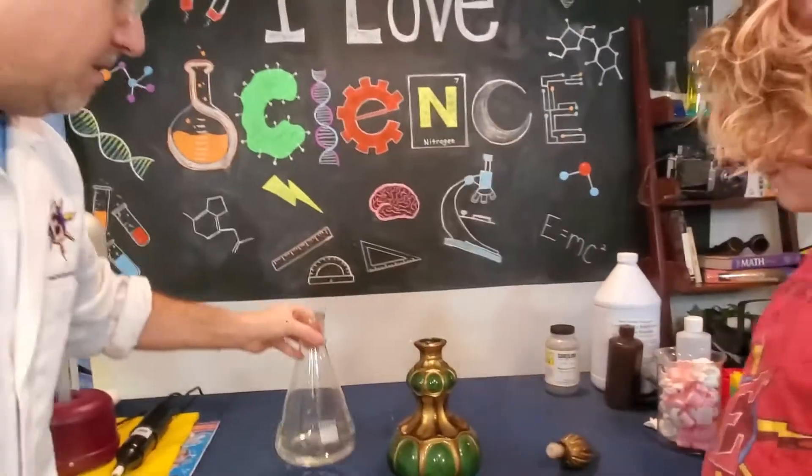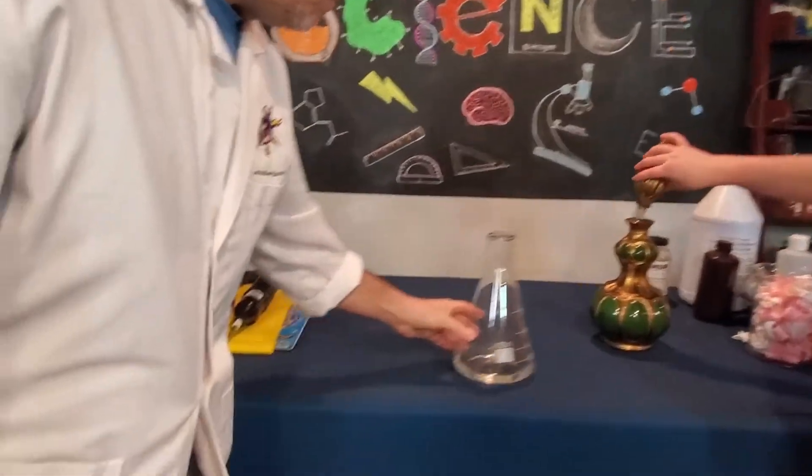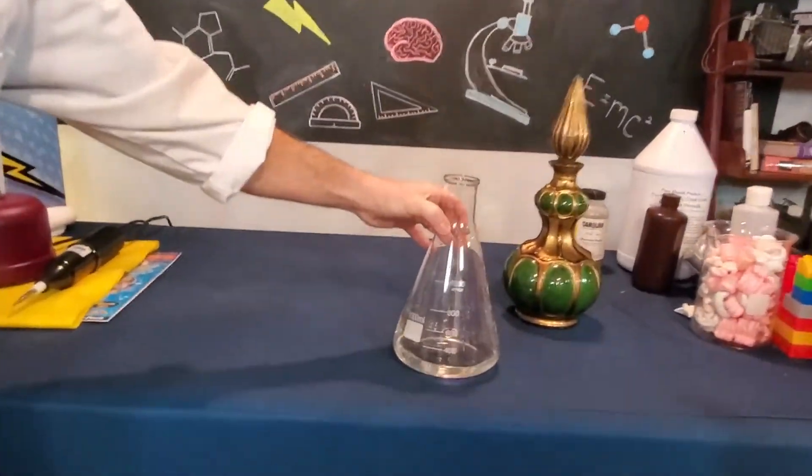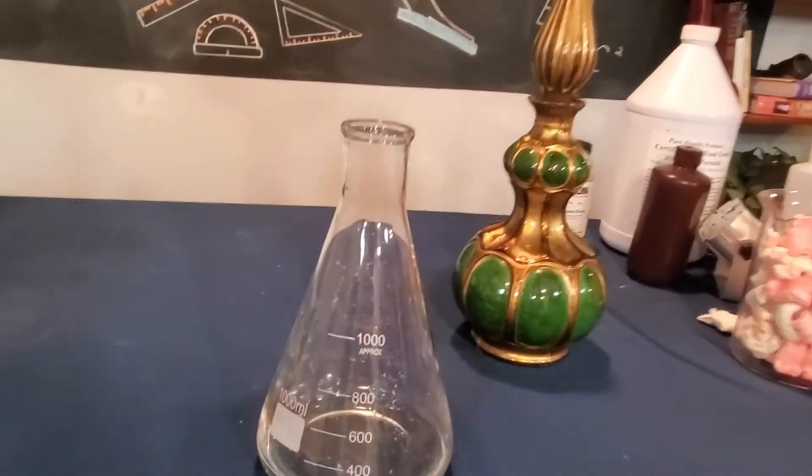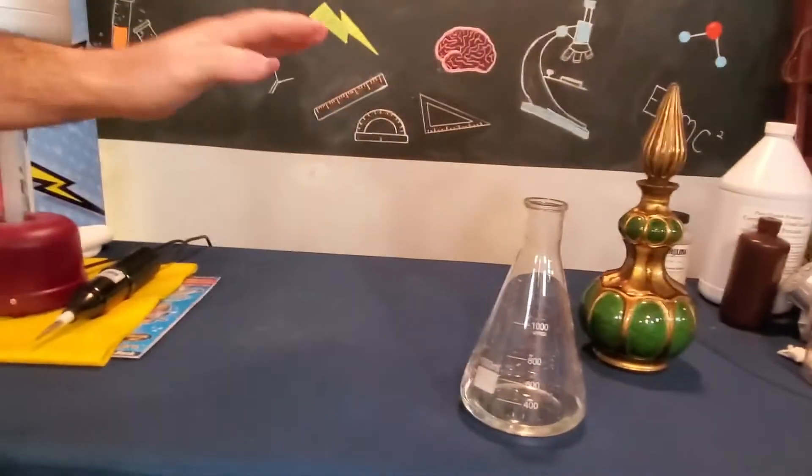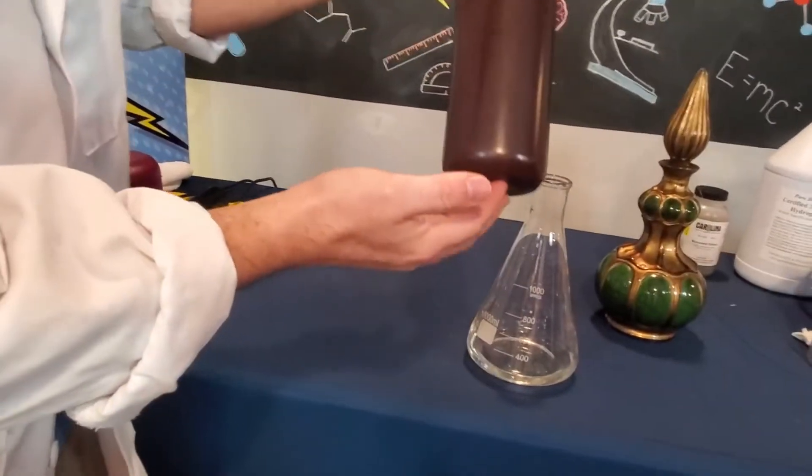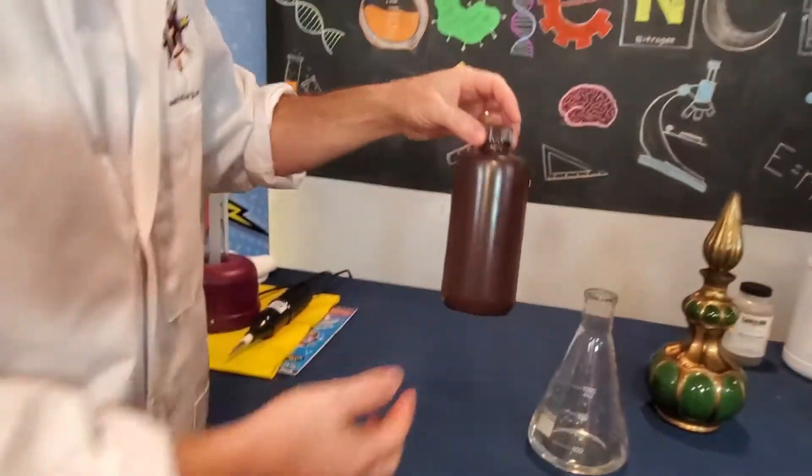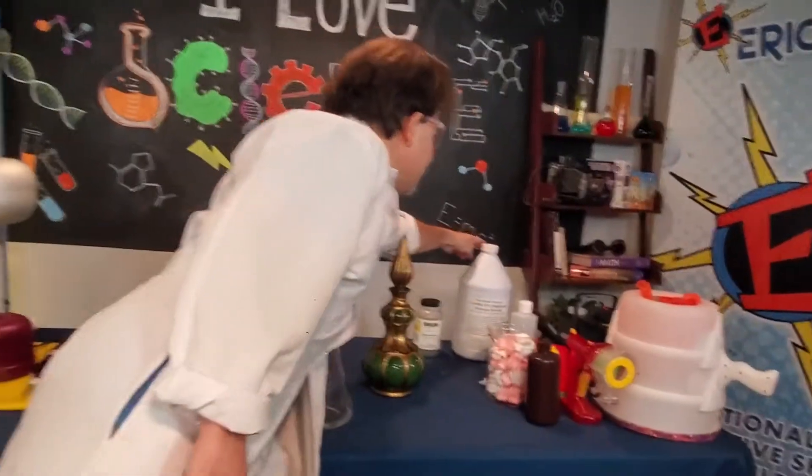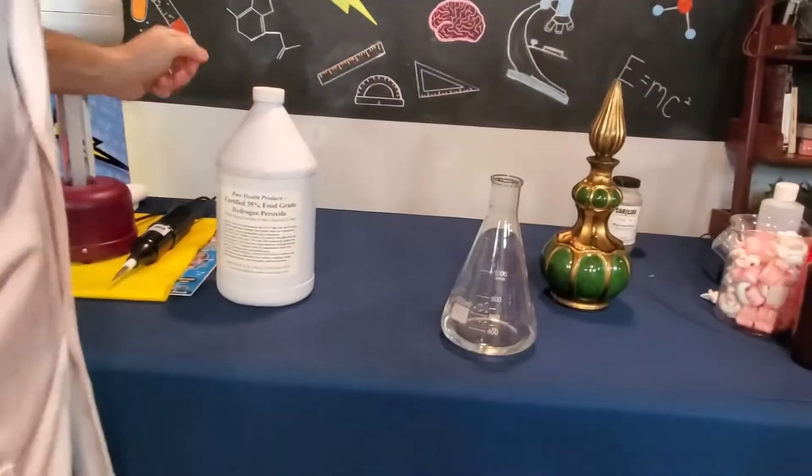Now, the Genie has gone away. So now, we're going to take a look at this Erlenmeyer flask. And inside, there's a liquid. The liquid is what was in the bottom of this Genie bottle. It's hydrogen peroxide. But it's not the hydrogen peroxide that you have in your bathroom. Hydrogen peroxide is usually about 5% strong. This hydrogen peroxide is 35% strong. It is food-grade hydrogen peroxide. That's what we put at the bottom of the container.